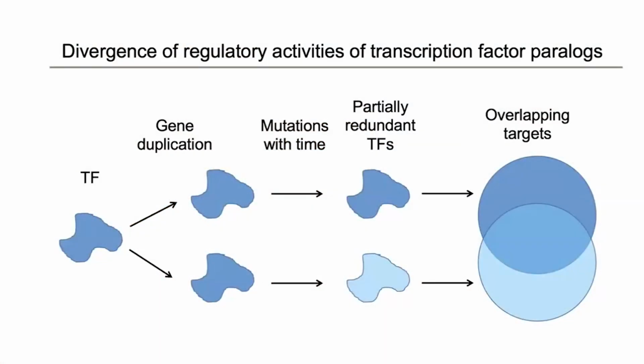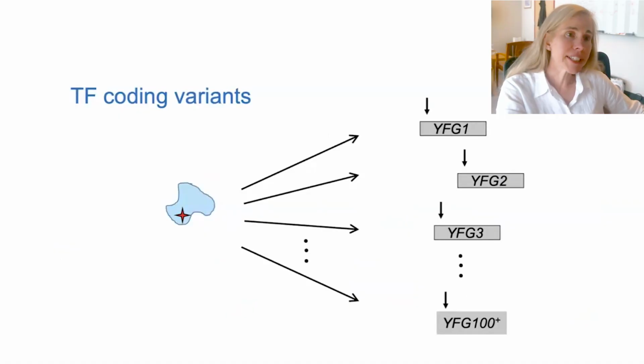There are numerous applications in which we aim to use PADIT-seq. As one example, identifying potential differences in the DNA binding activities of paralogous TFs can offer insights on differences in their regulatory functions and the mechanisms by which they are achieved. As another example, there are tens of thousands of TF coding variants whose effects on DNA binding activity are unknown. Coding mutations that alter the protein sequence of TFs have the potential to disrupt the expression of many hundreds or thousands of their target genes. Understanding the effects of such coding variants is part of the broader variant to function challenge in genomics. These are just 2 examples, but there are many more potential applications, including further development of the PADIT-seq technology that we aim to pursue.